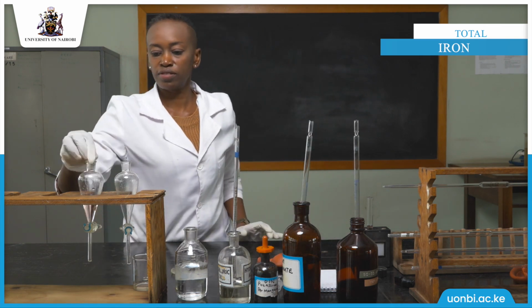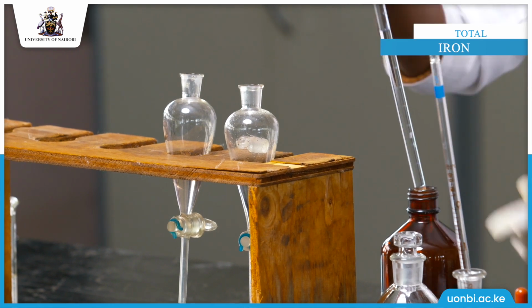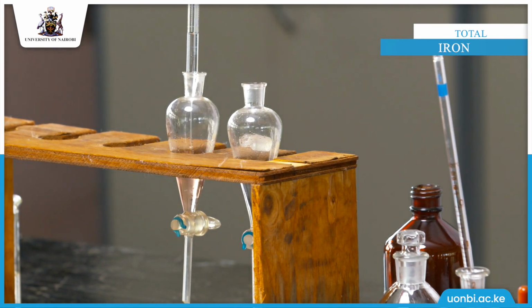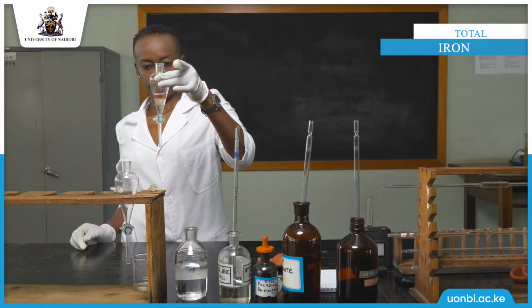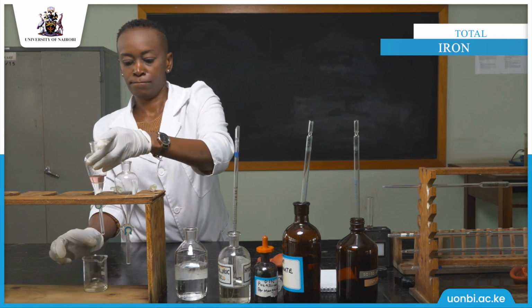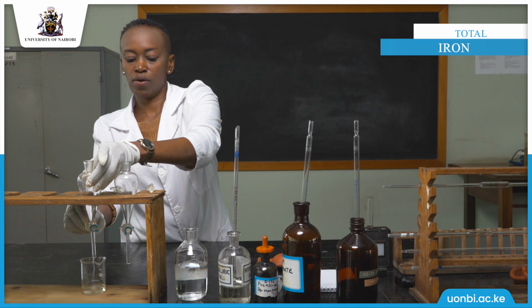Then we thoroughly mix the content. Then we separate. We discard the lower part and remain with the upper part.